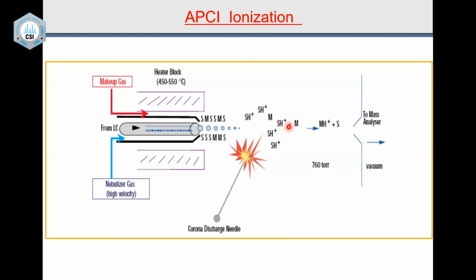So the protonated solvent molecule transfers one proton to it, and it becomes MH plus. That way, some of the low polar compounds, you will be able to really ionize them. And that is the principle behind APCI. So APCI is no beast.